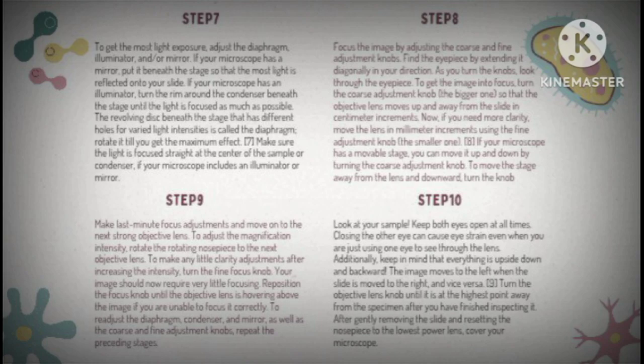Step 10. Look at your slide. Keep both eyes open at all times. Closing the other eye can cause eye strain even when you're just using one eye to see through the lens. Additionally, keep in mind that everything is upside down and backward. The image moves to the left when the slide is moved to the right, and vice versa.